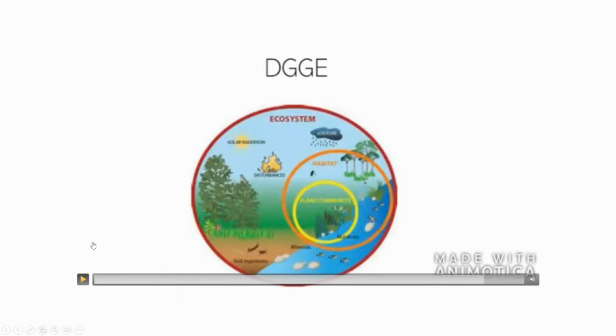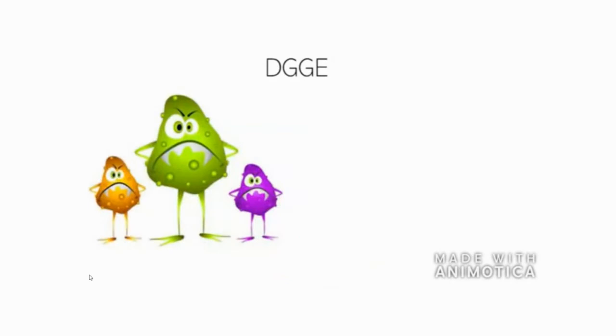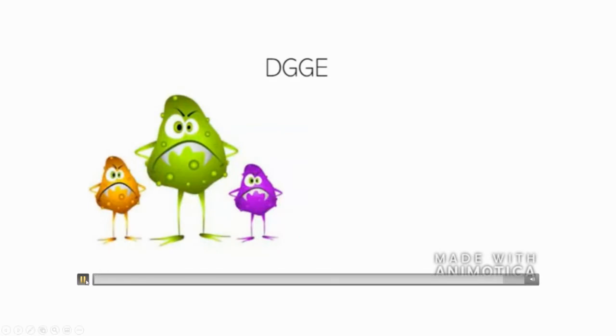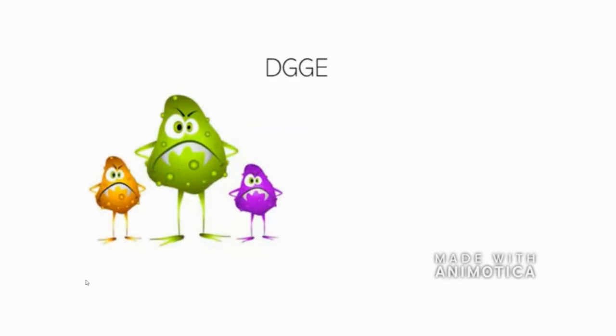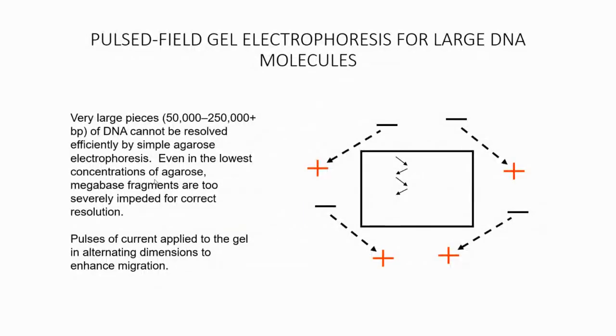Now you know that with DGGE, you can easily detect whether there is a mutation. This is frequently used to screen complex ecosystems and analyze various environmental samples in a short time. But also, the diagnosis of infections can be faster because of DGGE, and thus the identification of pathogens, because DGGE is not about the length, it's about what's inside that counts. So that's DGGE, okay.